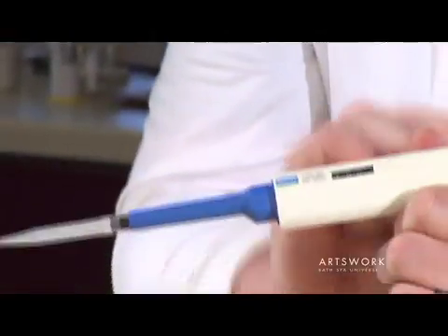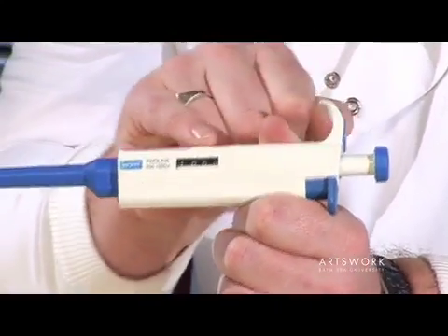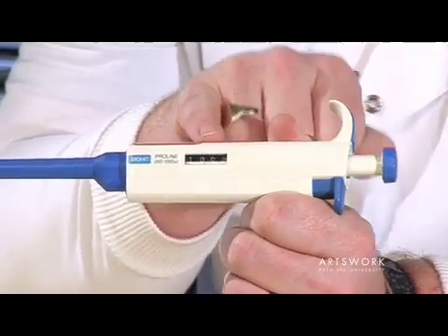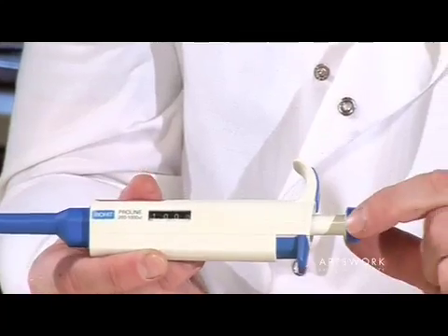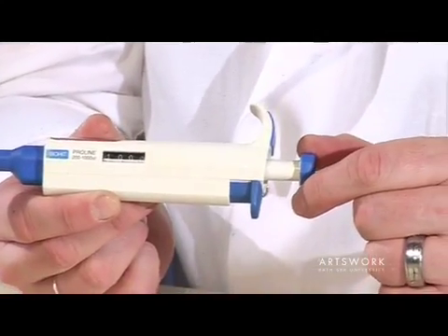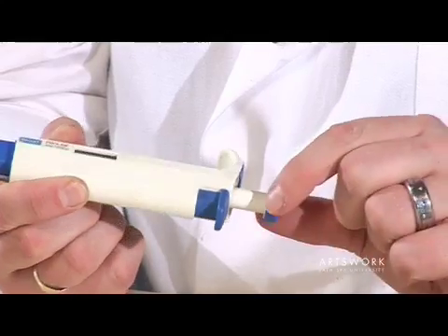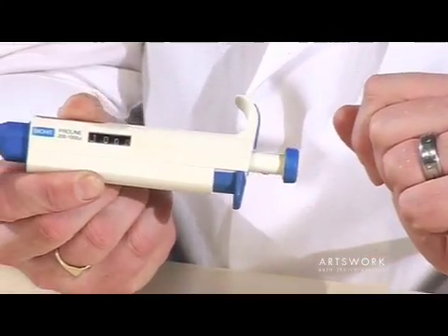We then need to check that the volume set is accurate. These pipettes are marked in microlitres, which are thousandths of a millilitre, so one millilitre is equivalent to a thousand microlitres. The volume is set by turning the wheel at the top of the plunger — turning it forward and backwards. In this case we want it set to one thousand microlitres to pick up one mil.